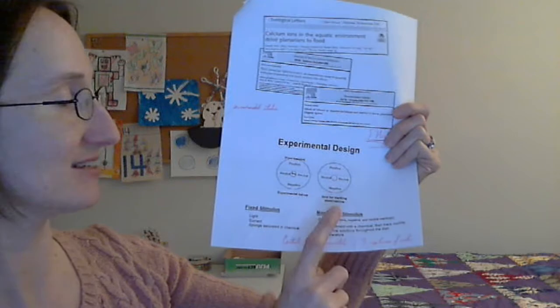Now, there are two general ways to set up the experiment. One is to use a fixed stimulus. The other is to use a non-fixed stimulus. A fixed stimulus simply means that whatever you're testing is in a certain spot on that grid sheet. Typically, you would put that at the top of the grid sheet, and your worm you'll put in the middle.